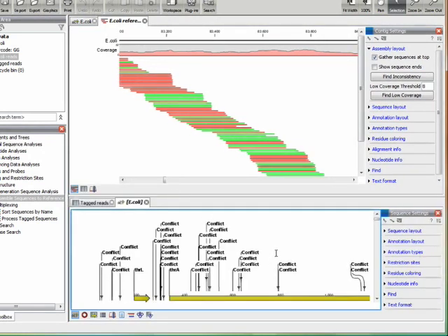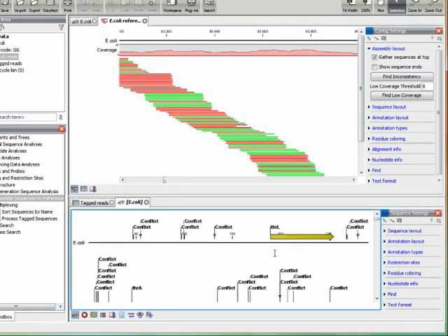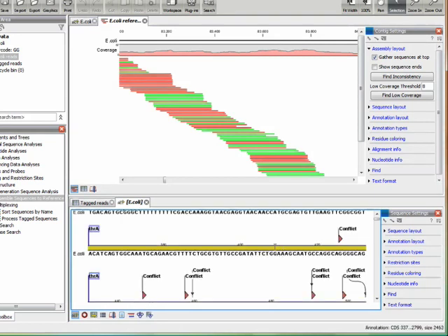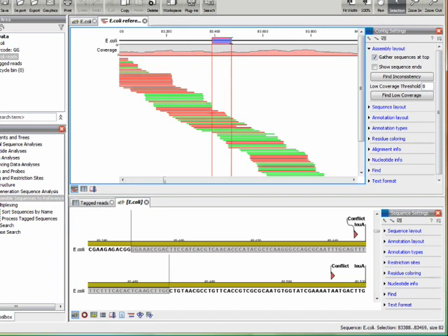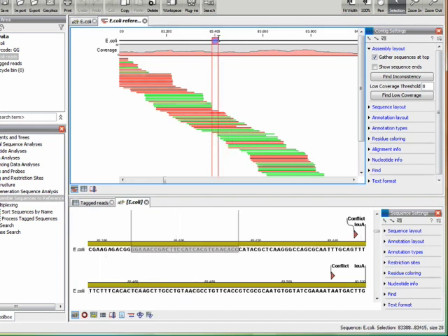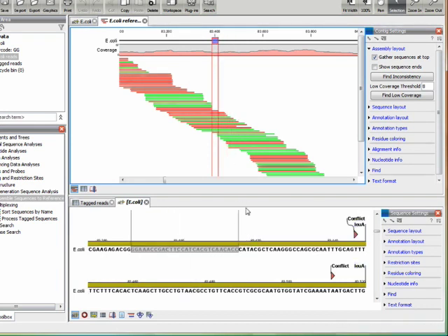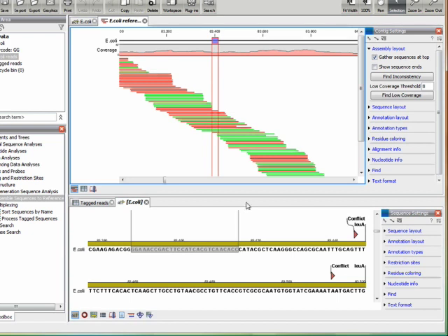So that we can have both a higher level overview and some details from the reference. What you can do with this view setup is do a fast visual inspection of whether or not the sequence DNA is functionally different from the reference sequence.